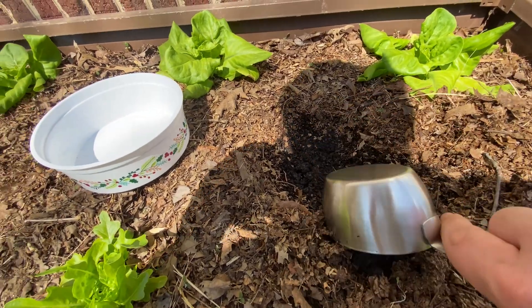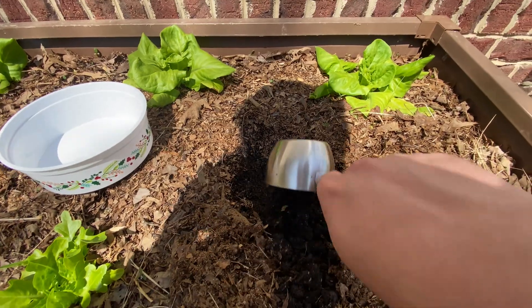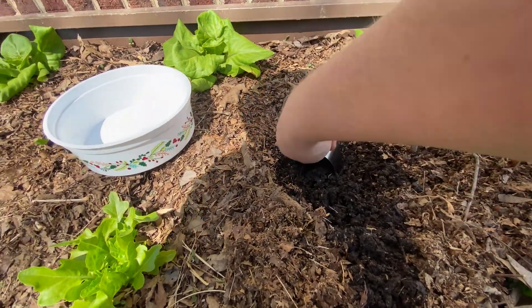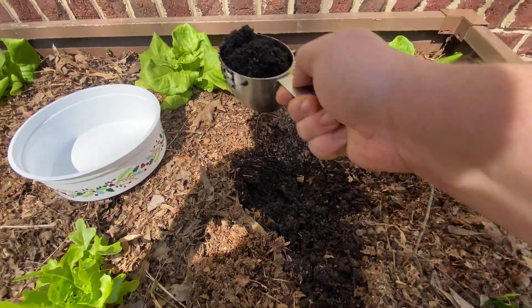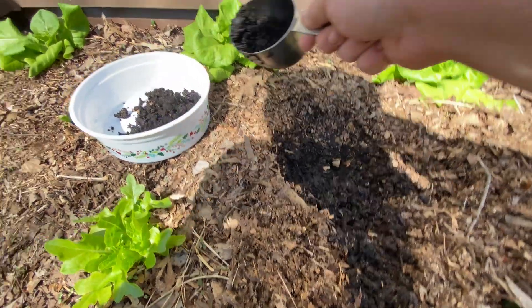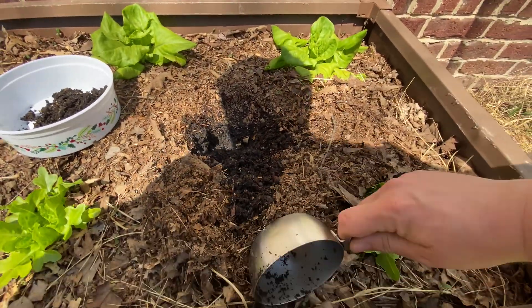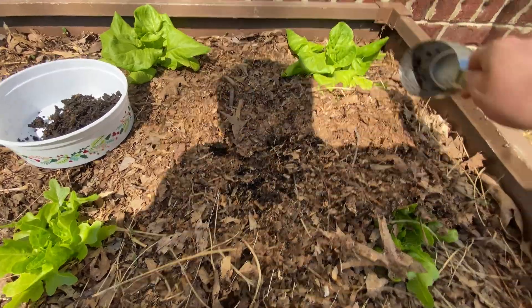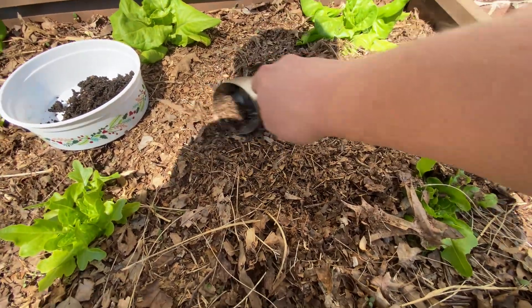I already have some lettuce here, so I need to be kind of careful. About there — that's about a cup. Dump that in there, just a little bit more. Now I'm going to fill that back up like nothing ever left.